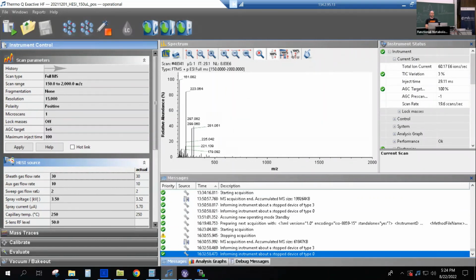Cool. All right. I guess if there are no more questions... Oh, Stefan? What does the RF look like, is there a rough guideline, higher RFs for higher masses? Yes. In our experience, yes.